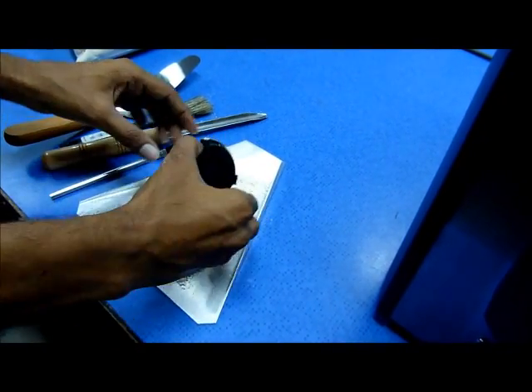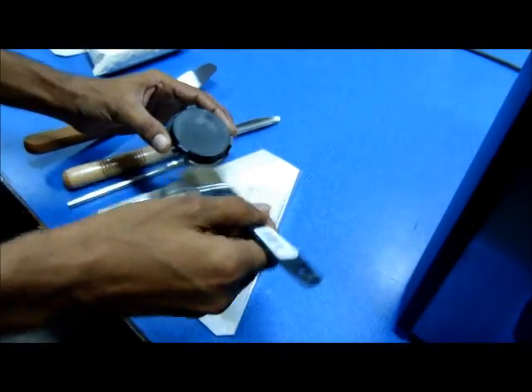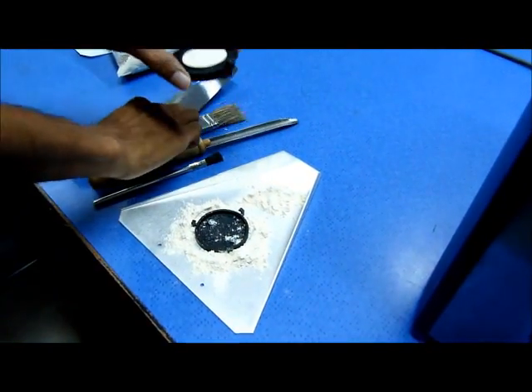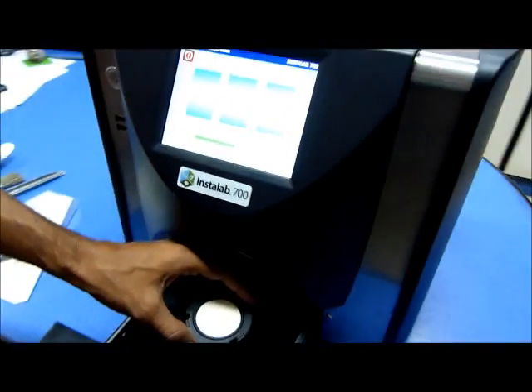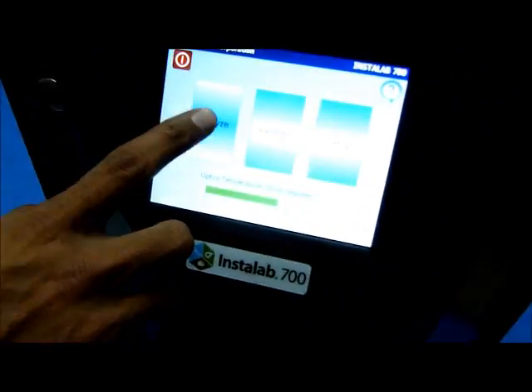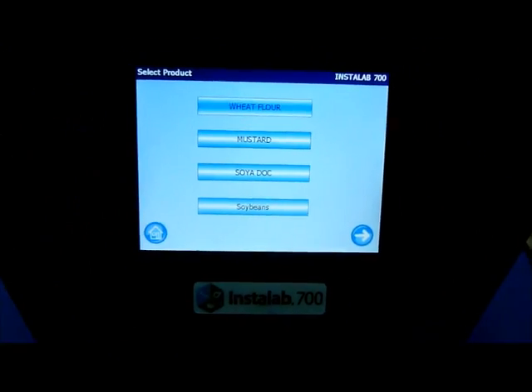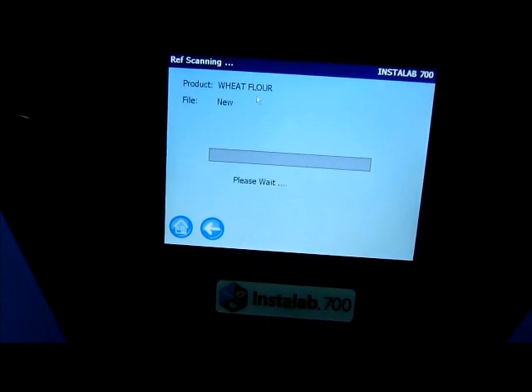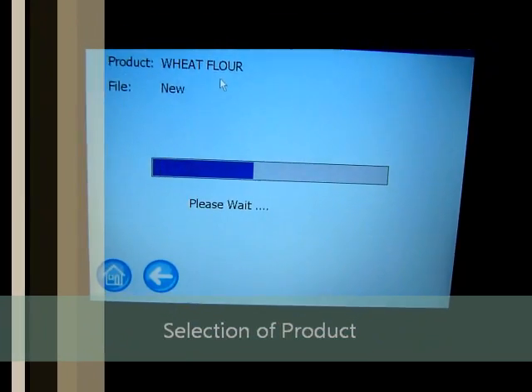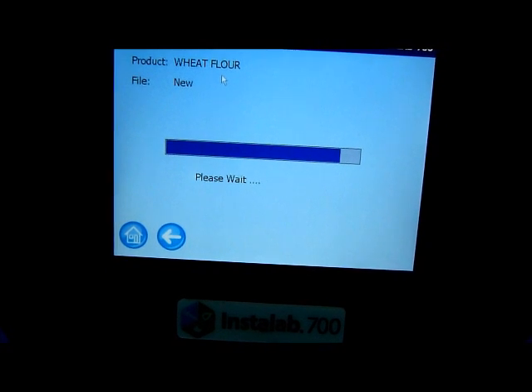We are making a presentation using the wheat flour sample. It is always ideal to have a uniform particle-sized sample for analysis through the NIR analyzer. Spatula, sample cup, sample tray holder, and cleaning brush are all standard accessories with the system.